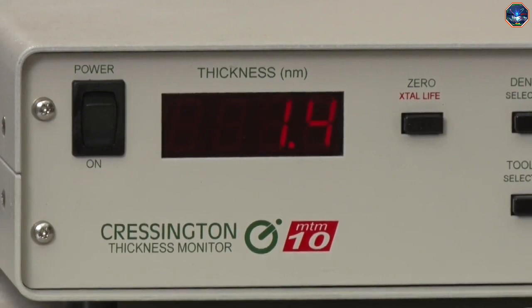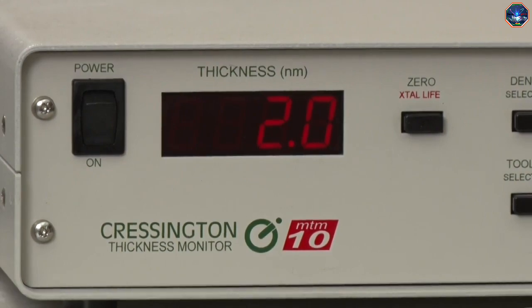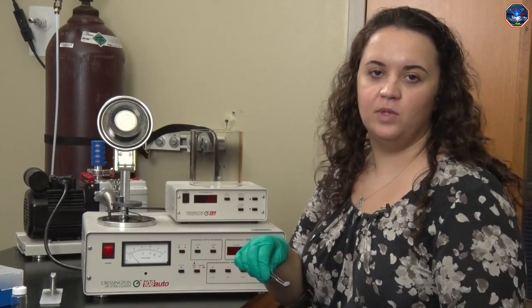A 2 nanometer coating is usually sufficient to prevent charging. If your sample is conductive, or if you will be imaging in an environmental SEM, you can skip this sample coating step. Our sample is now ready for SEM imaging. Let's head to the imaging lab.